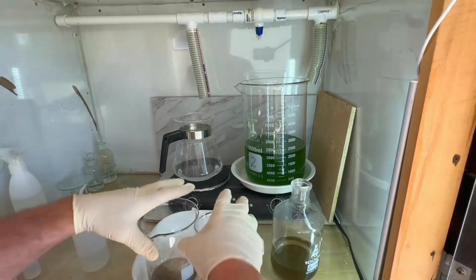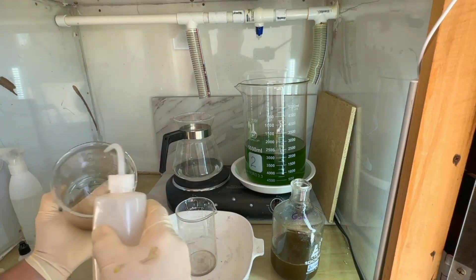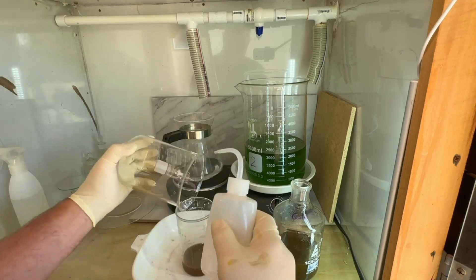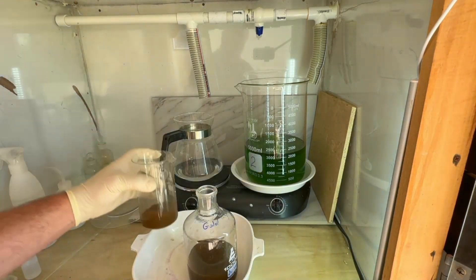We'll do some boiling water washes first — did those. Transferring to the smaller beaker again and doing a few more boiling water washes with boiling distilled water. We want to clean that up before we do a hydrochloric acid boil to take even more contaminants out.